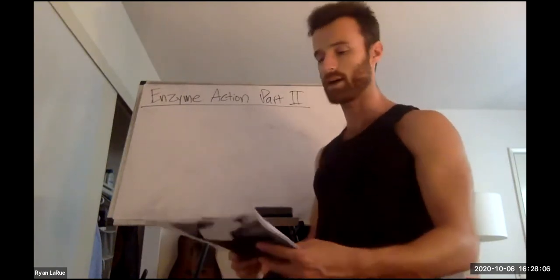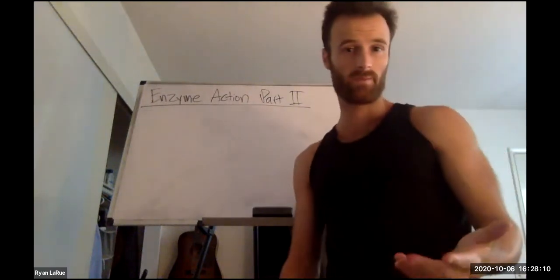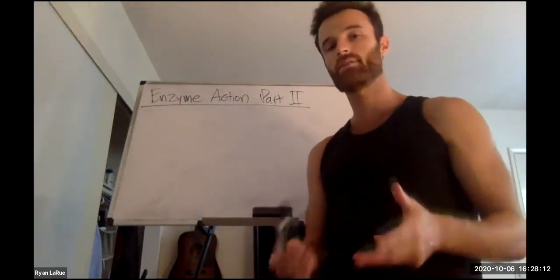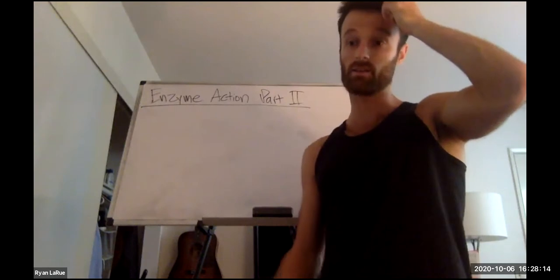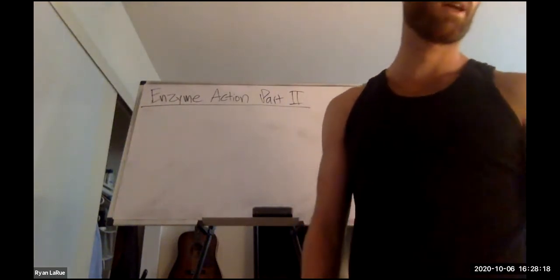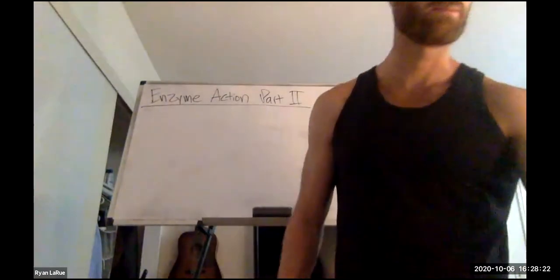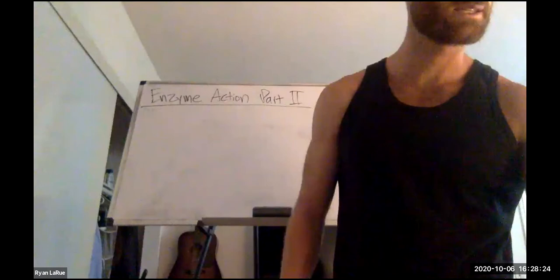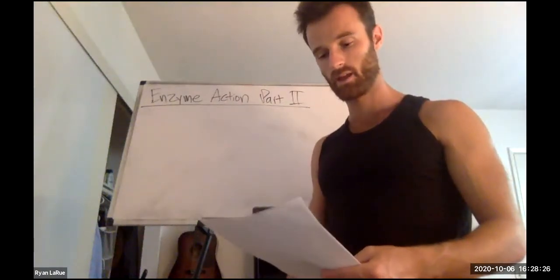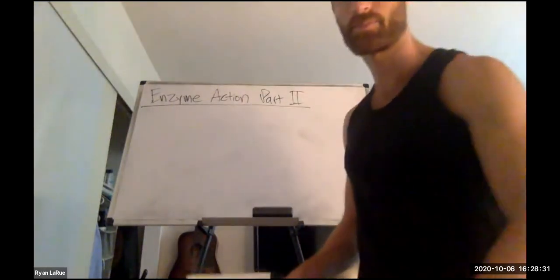So in this lab, we use the optimal saliva dilution that we discovered last week. And I believe from Stacey's videos and her data collected, 1:16 was determined to be the optimal dilution.